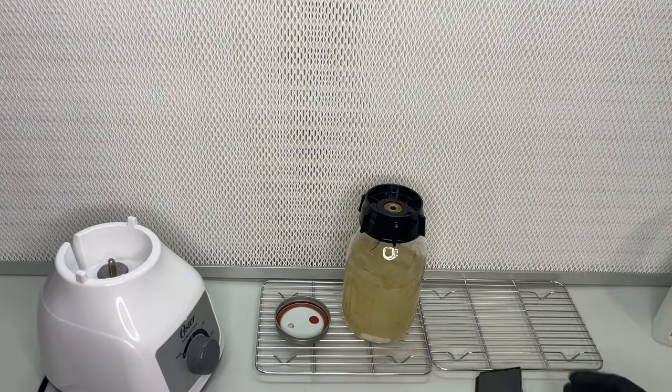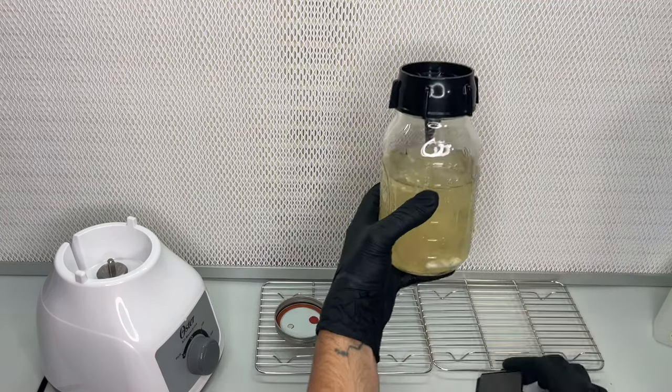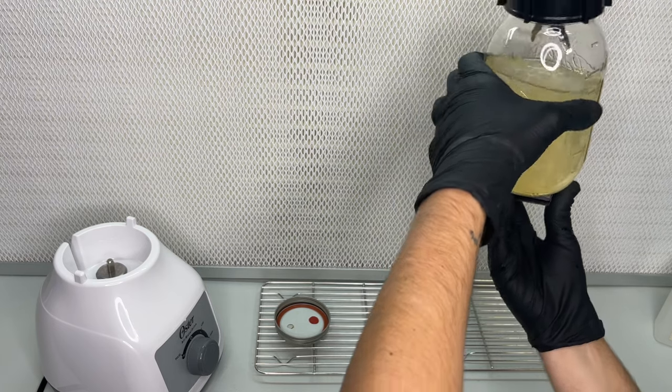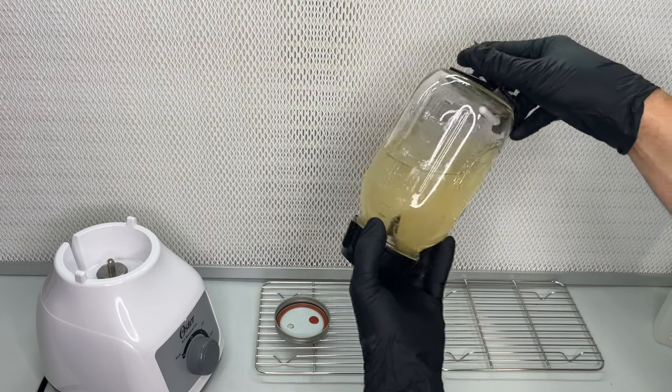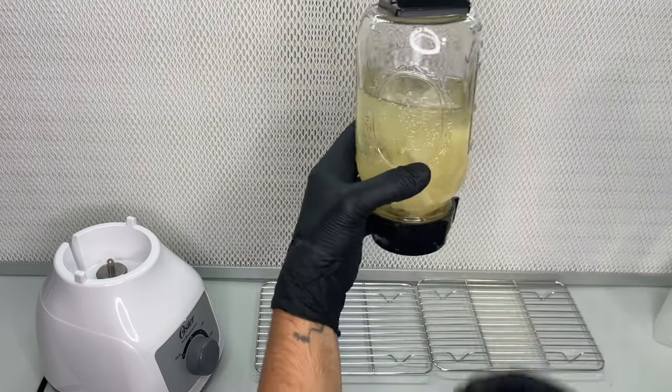To prevent the magnetic stir bar from being chopped up by the blade, I'm going to use a magnet to hold it to the bottom of the jar while it is flipped upside down. The magnet does a pretty good job and I'm glad that I had one laying around or else I wouldn't have been able to blend this jar.